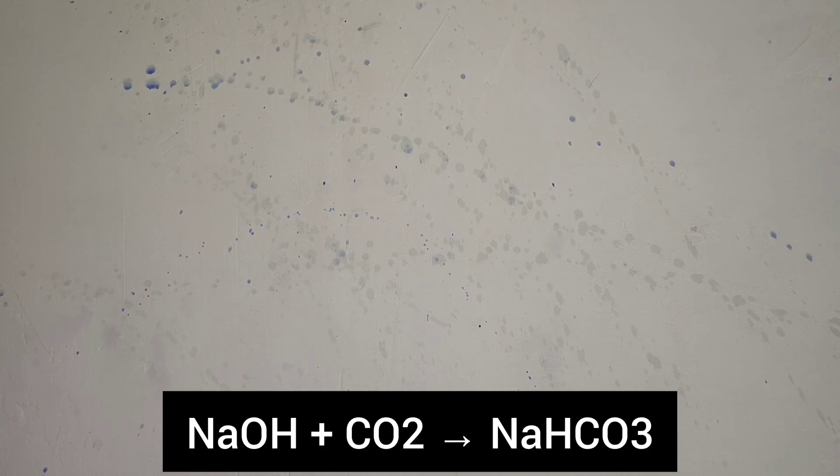The reason this happens is because the carbon dioxide in the air reacts with sodium hydroxide to form sodium carbonate, which then reacts further to form sodium bicarbonate. The pH drops below 9.3, so thymol phthalein turns colourless.